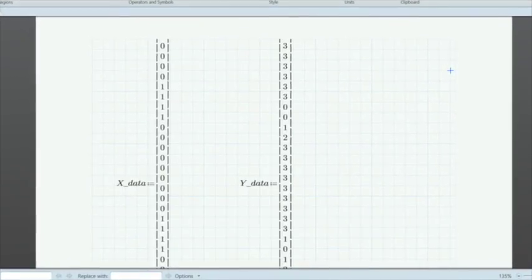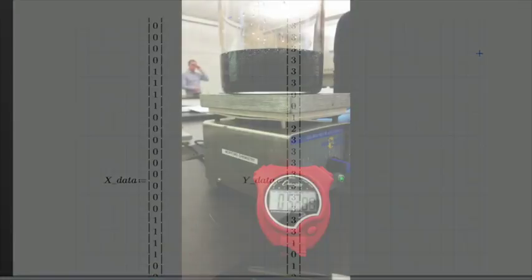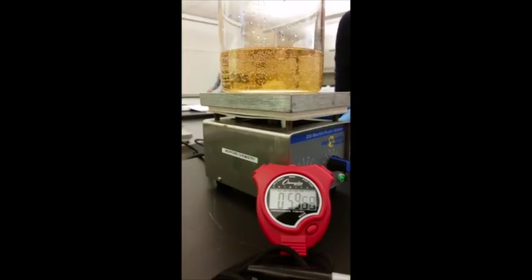The Y data was digitized by inputting a 0 if no starch was seen present, to a 3 when the most concentrated starch color was seen. This oscillating reaction can be quantified from the digital data to examine the changing components in the reaction with time.